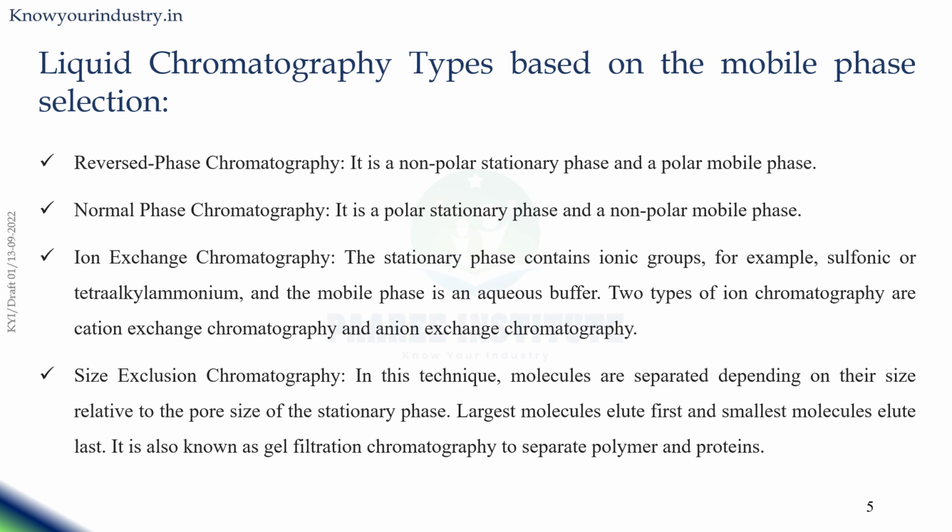Polar means mobile phases like water or ethanol. In the case of normal phase chromatography, it is a polar stationary phase and a non-polar mobile phase.